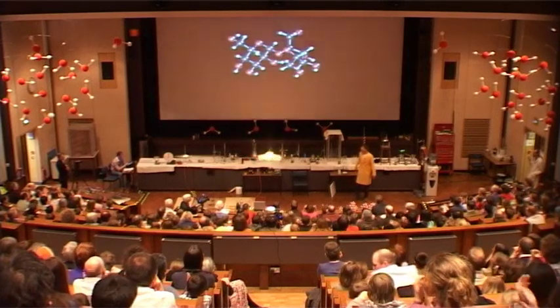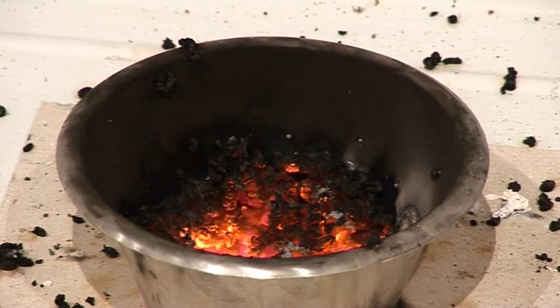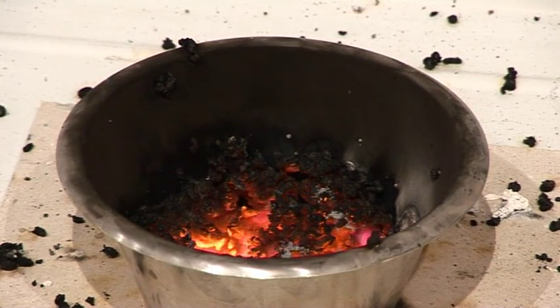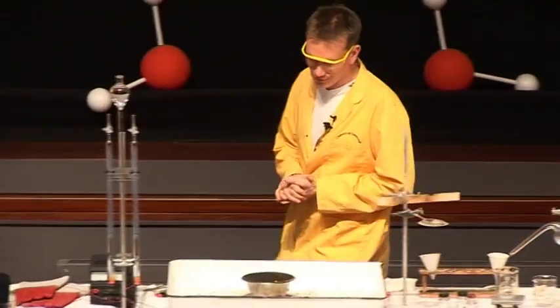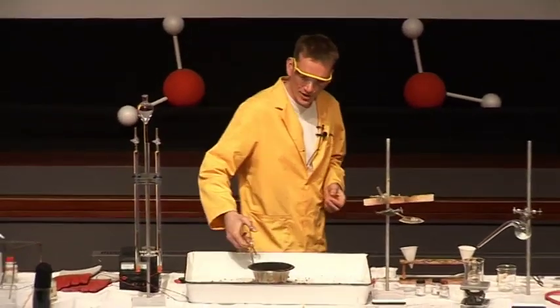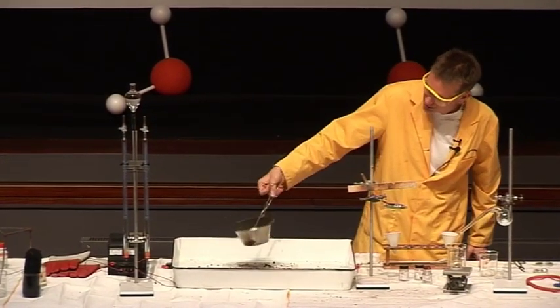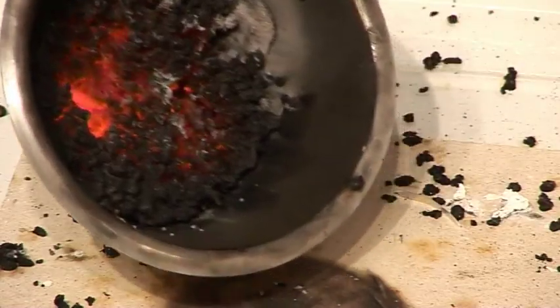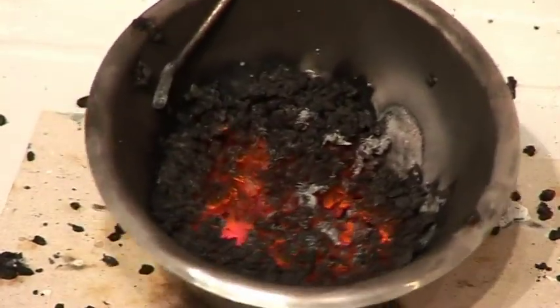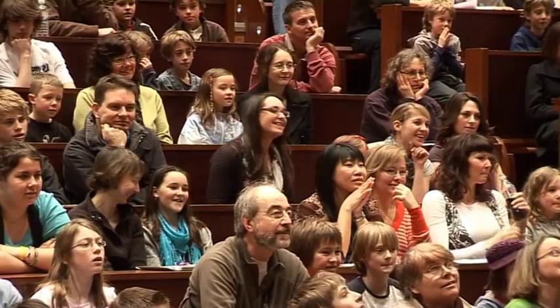A rather violent reaction. Rice Krispies, of course, give us our energy — it's one of the foods we can use to provide our energy. You'll notice at the bottom the burnt Rice Krispies; the container is actually red hot now, and at the bottom there's a sort of black mass. This mass is carbon — one of the elements that's present in the Rice Krispies.